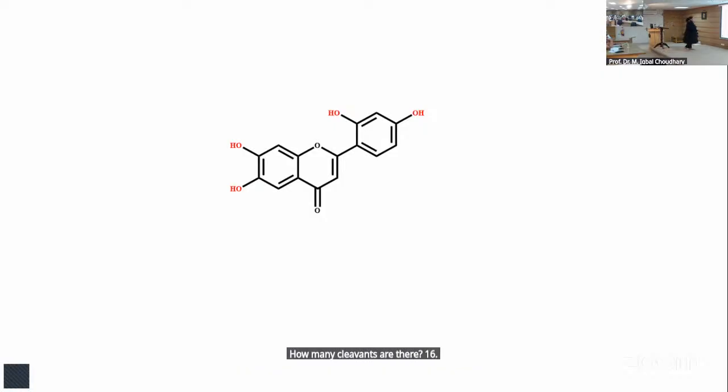And how many quaternaries are there? Can check again. So 1, 2, 3, 4, 5, 6, 7, 8, 9 quaternaries are there. Okay.